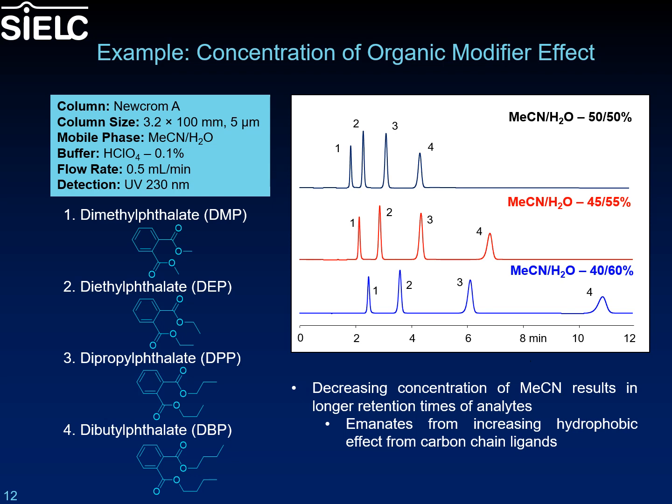Each of these compounds separates out on the column by their different degrees of hydrophobic effects, as they all contain the same substitution but differing lengths in alkyl chains. If one were to try to separate these compounds using a 50% acetonitrile and water mixture, they would find that they would get reasonable separation of each of the compounds.